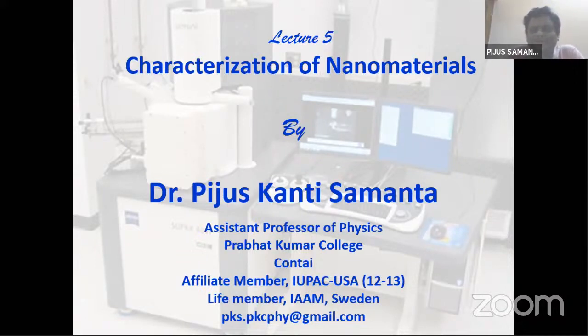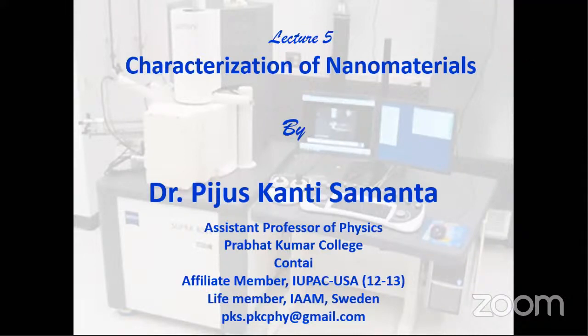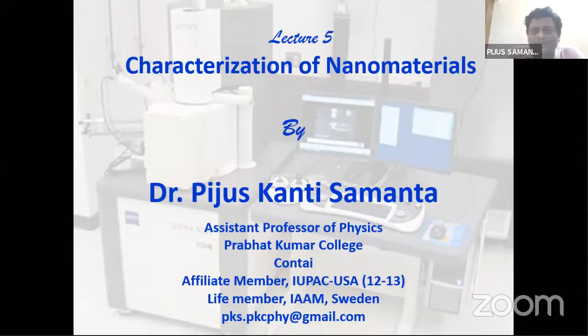Last lecture I discussed scanning electron microscopy, where we saw that a high energy electron beam is focused on a sample, and the scattered electrons are collected by different types of detectors, backscatter detector, secondary electron detector, etc. And then by considering the scattered amplitude and phase of the scattered wave, we can form the image.